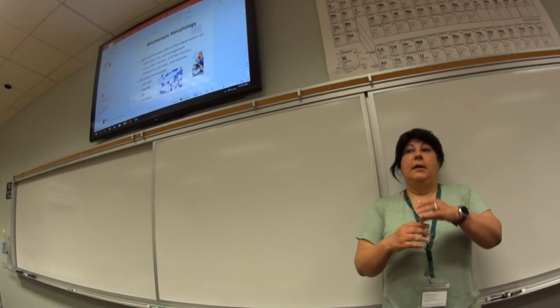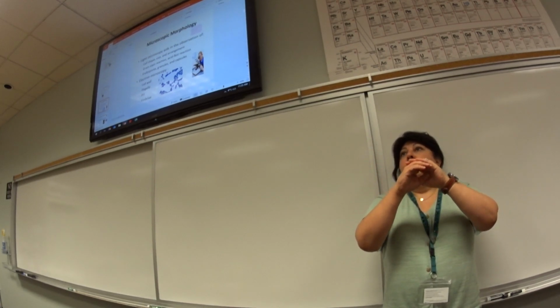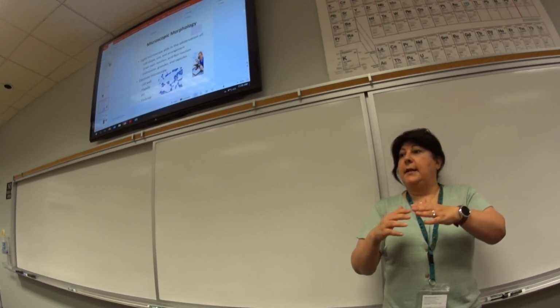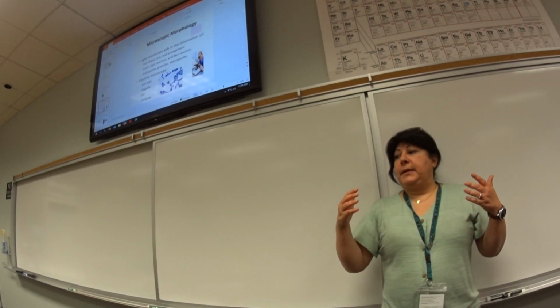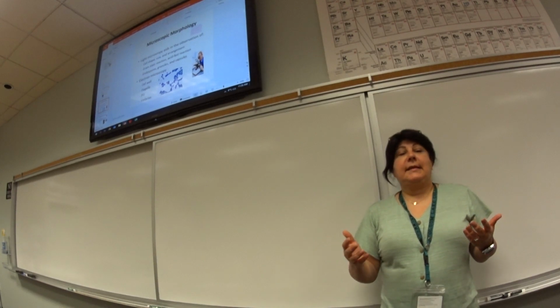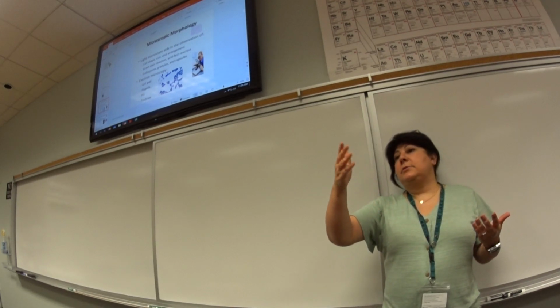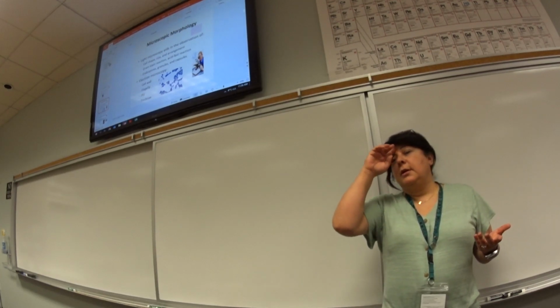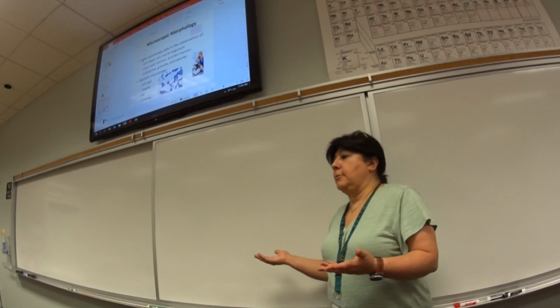So on the first day, you would write on it, this is unknown lab, your name, the date, first day. Your introduction part of it is basically a purpose. You put it on the first day. What I am doing is I have received unknown number 5, and I will be going through a series of biochemical assays and phenotypical assays in order to identify my bacterial unknown as one of the possibilities given to me by the instructor. The purpose of biochemical assays is to differentiate and eventually identify a single bacteria.